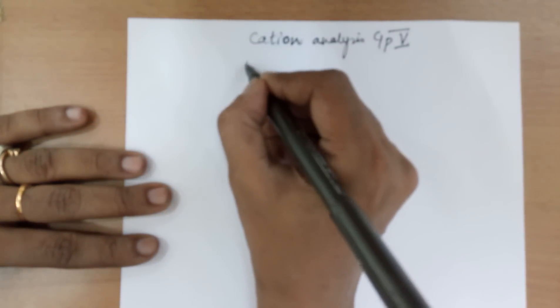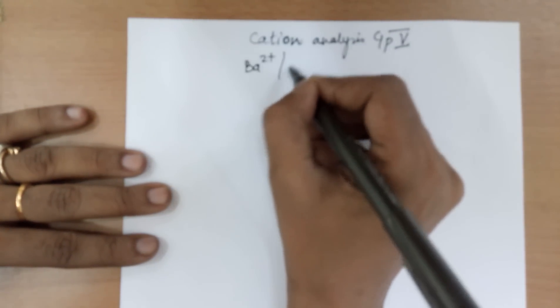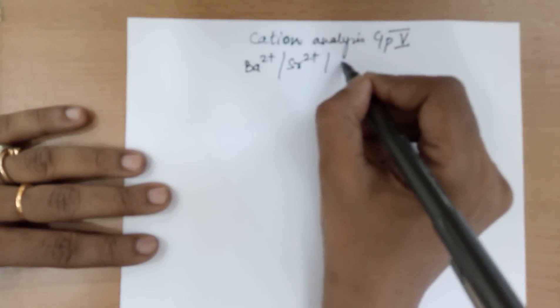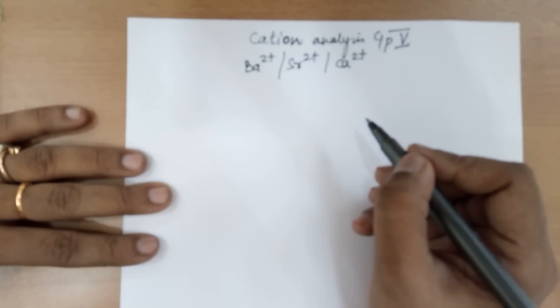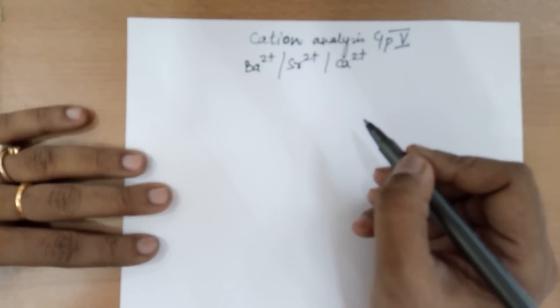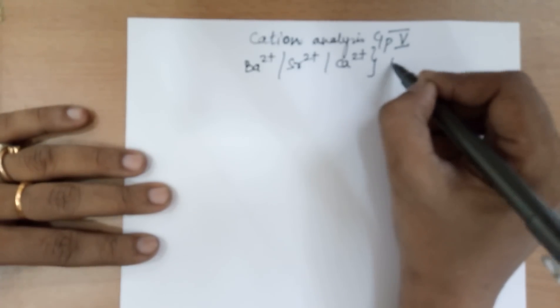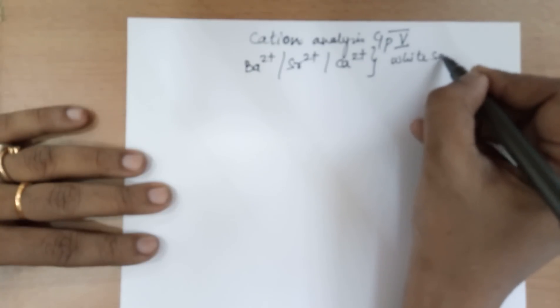The cations of group 5 are barium, strontium and calcium and none of them is a colored salt. This would only be applicable to white salts.